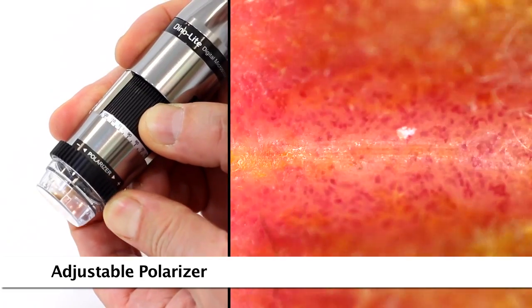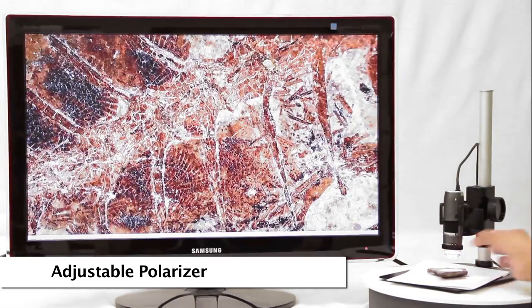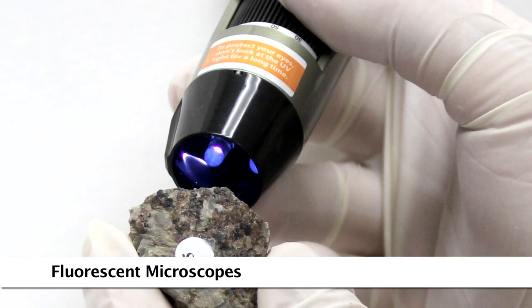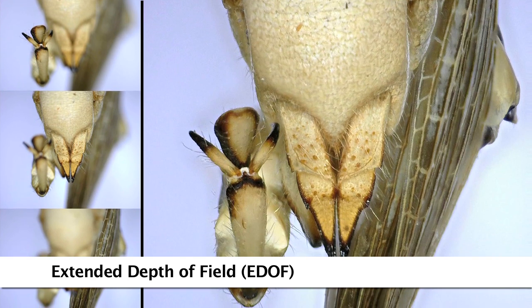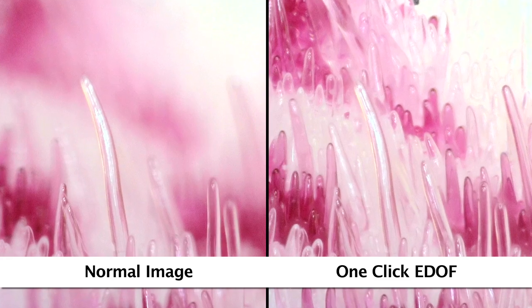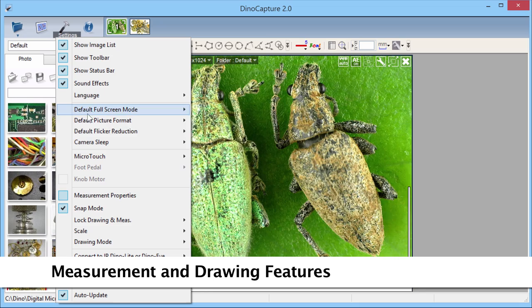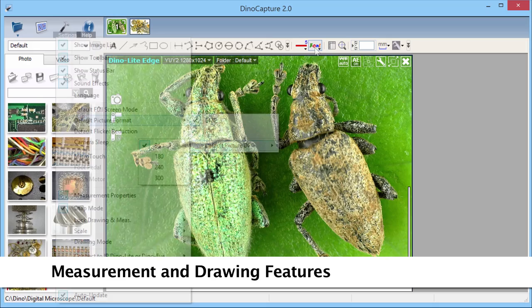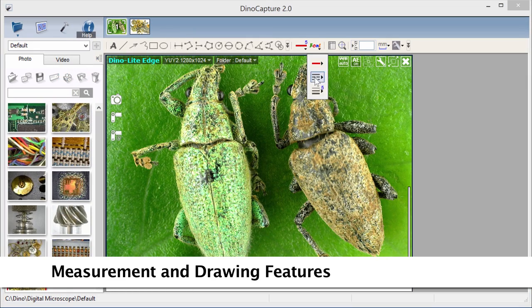Some models have a built-on polarizer that helps provide greater clarity and different results in imaging. There are many fluorescent models to choose from in various wavelengths. EDOF models provide simple one-click focus stacking, capturing multiple images at different depths and stacking them into one clear image. The included software has measurement tools for compatible measurement models as well as drawing and annotation tools.